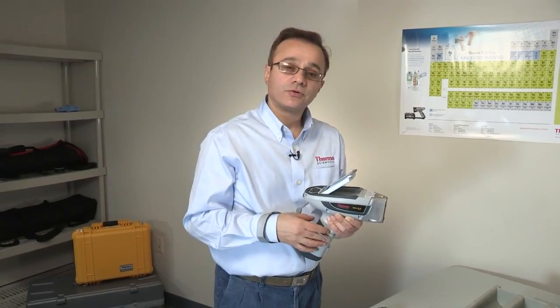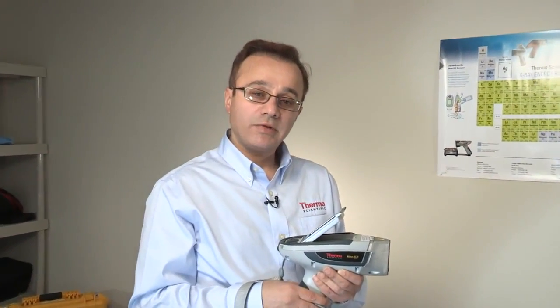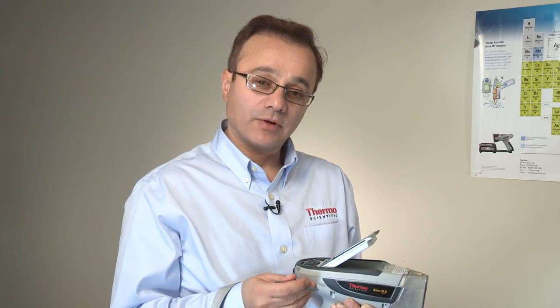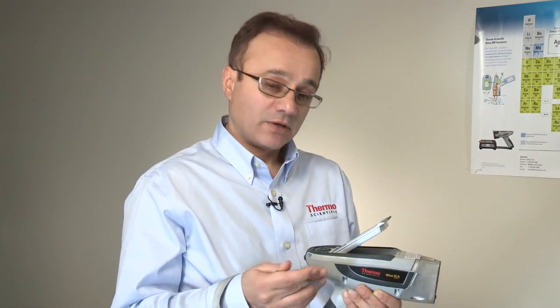This is one example that shows how in one minute you can get whole assays of one sample. This sort of analysis can help you make decisions promptly in the field because you will get the results in real time.